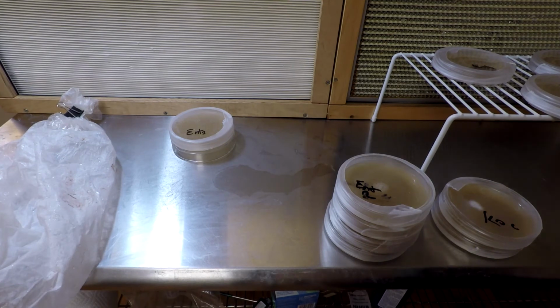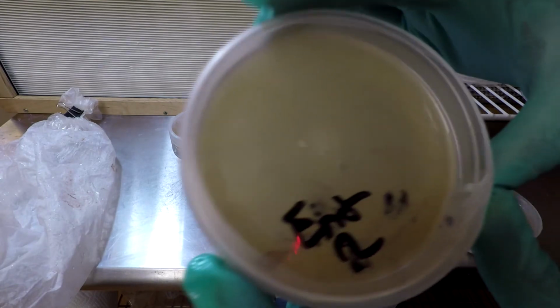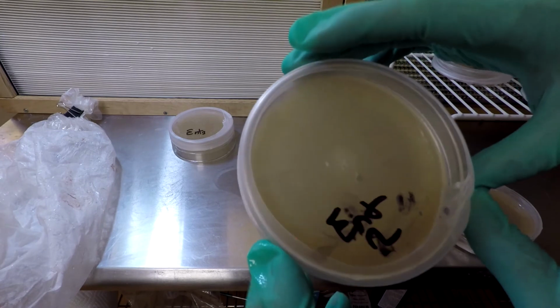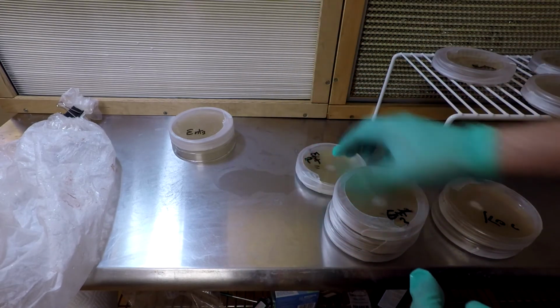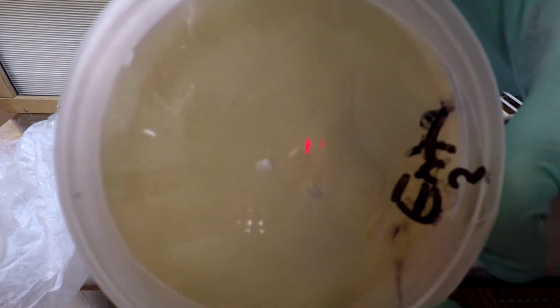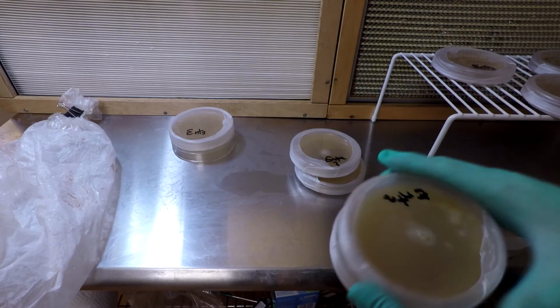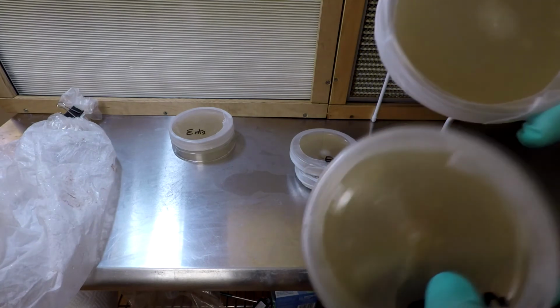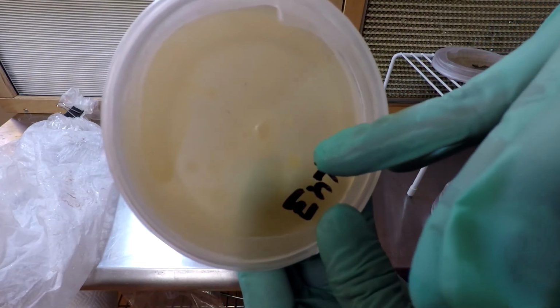I just got done doing another transfer of these entolomas. See the dish that I made the transfer from? The two cuts out of it. And only about 3/4 of an inch across of clean mycelium. It looks like this dish is pretty clean. And then I took two more transfers from this dish. And it was clean too. These two dishes look somewhat clean, but they definitely have some bacteria spots. You can see there's a colony of bacteria right there.